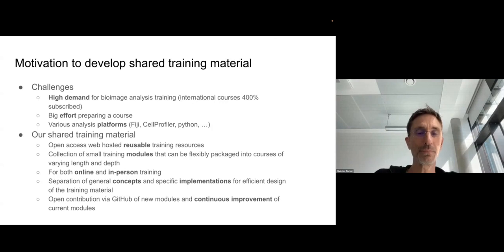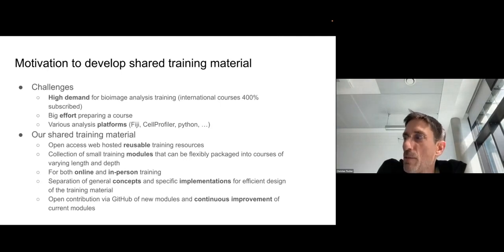That's the idea. We have already used this teaching material for online teaching. We actually used it quite a bit during COVID, and also in person. So it works in both contexts. And then what we try to address is this issue of having all these different image analysis platforms by having, for each teaching module, a separation of the concept that you want to teach.